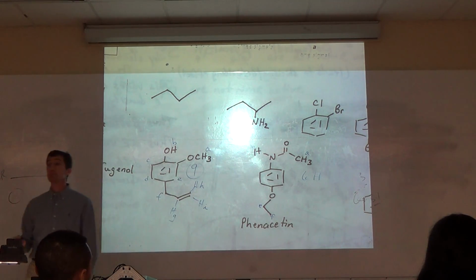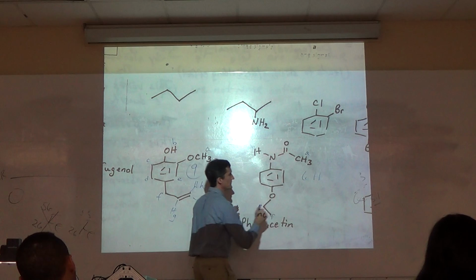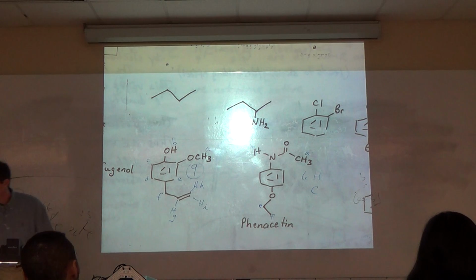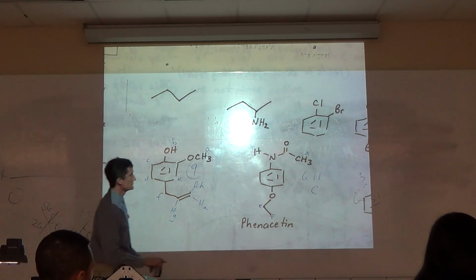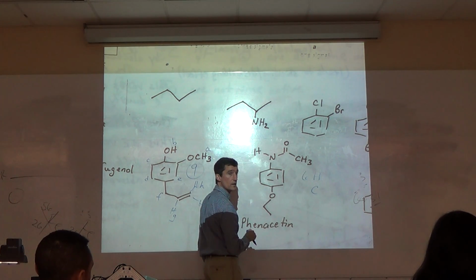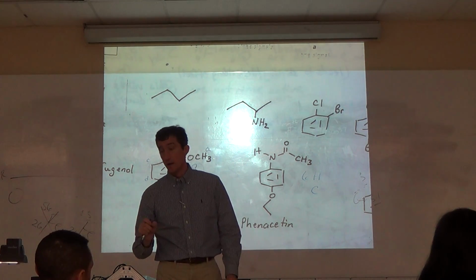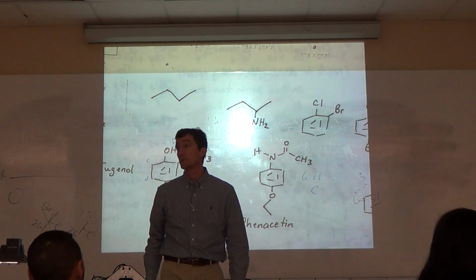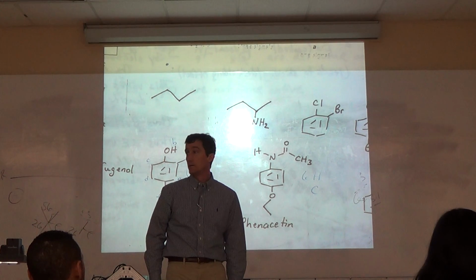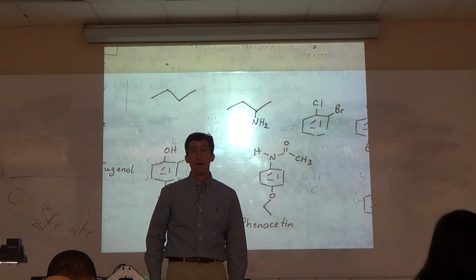While we're here, how many carbon signals? We're not going to do carbon NMR until way over in the handout, but let's do it here. It's how many unique carbons are in the molecule. Wouldn't this be under the stipulation that they're all carbon-13? What is the natural abundance of C13? Not as much as 12.